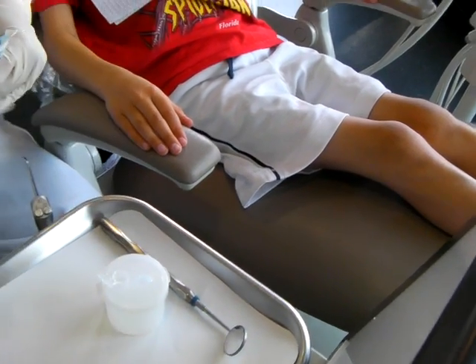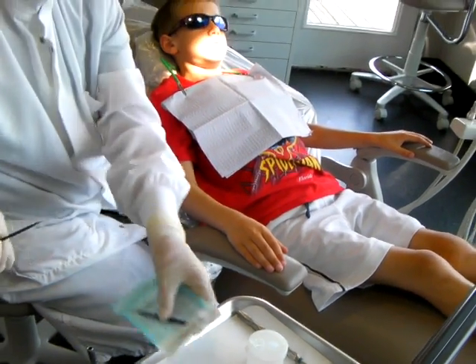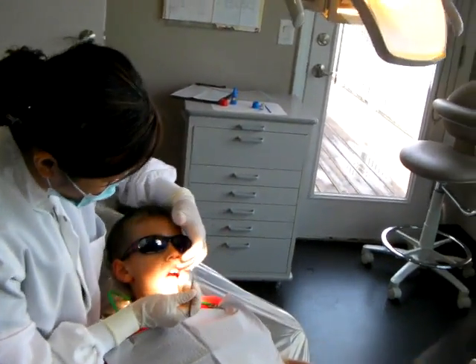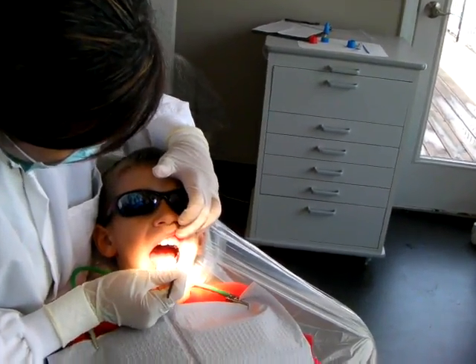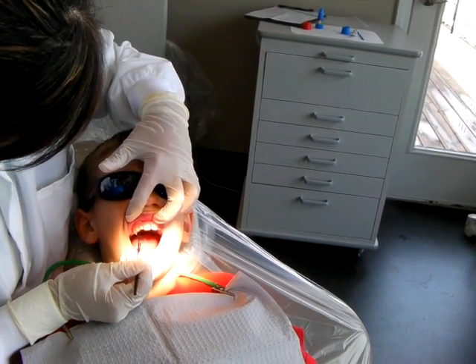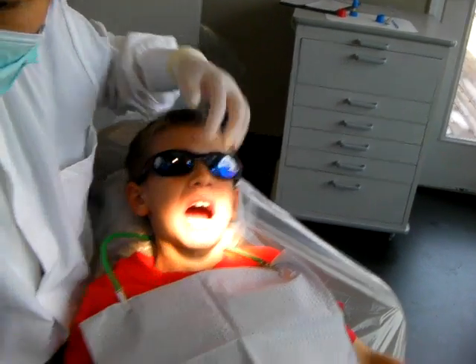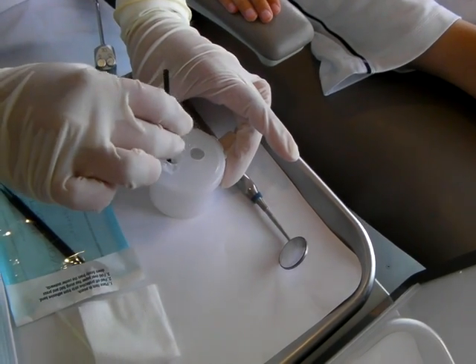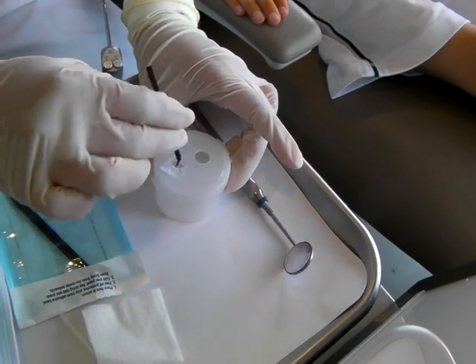take out one micro brush and the first micro brush you're going to swab the facial surface of the teeth. Put it back in the buffering solution, spin it around and that's it.